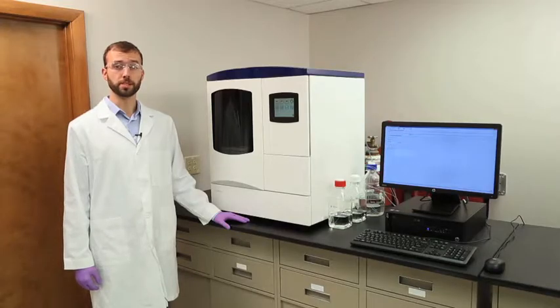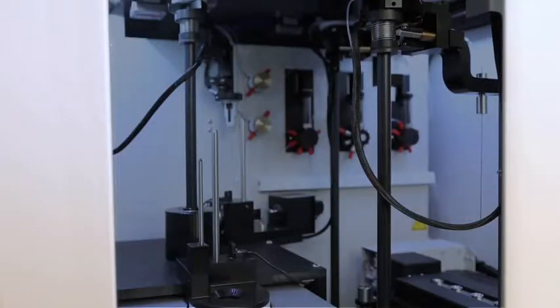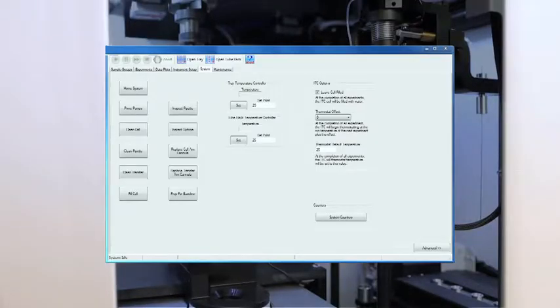I'd like to show you how to manually clean a syringe on the MicroCal ITC automated system. With the MicroCal ITC automated control software open, click the inspect pipette button in the System tab.